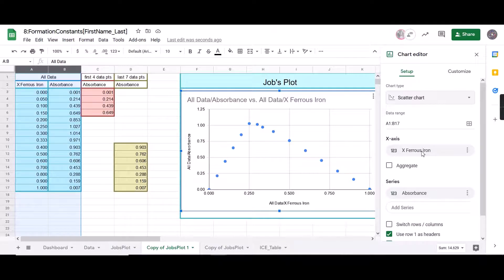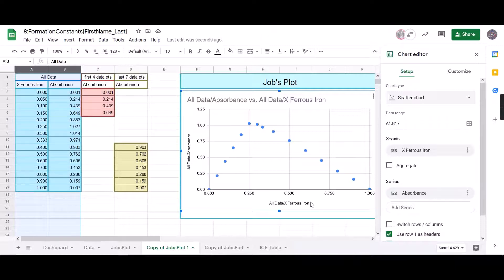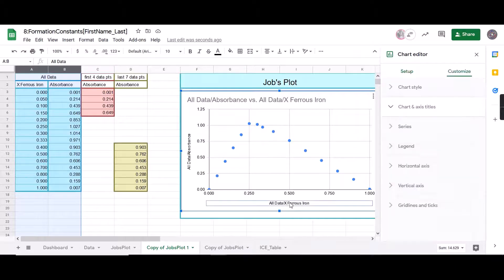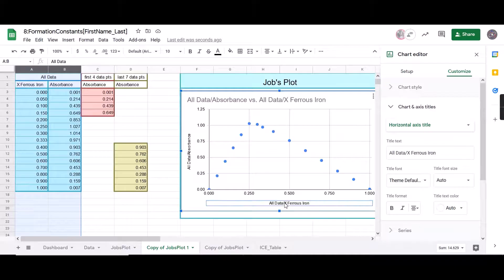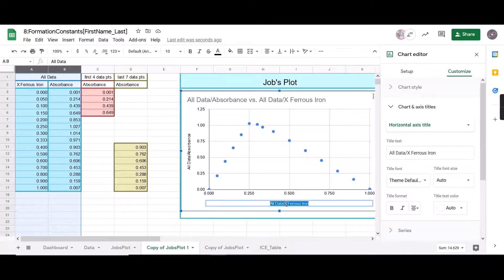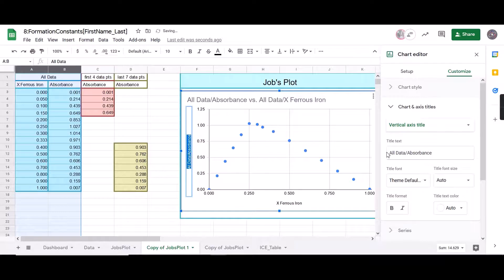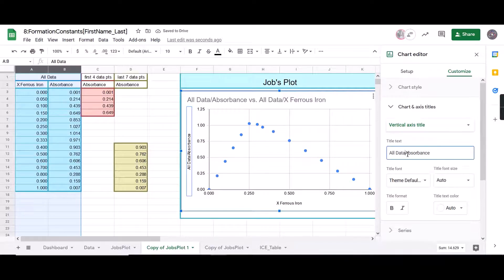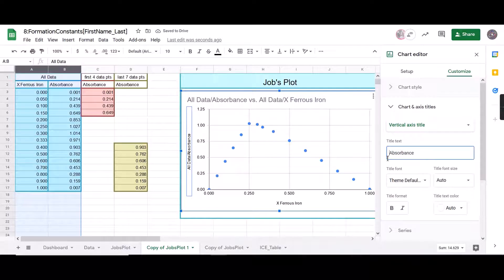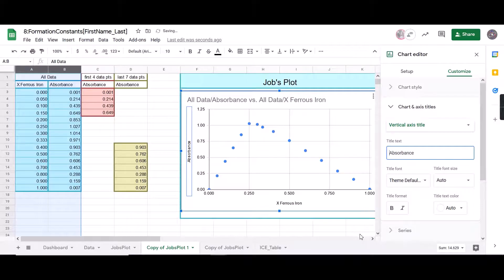You want to make sure that our x-axis is our ferrous iron and our series, which is our y-axis, is our absorbance. And we're going to double check that the labels for these are correct. You can either type over there or you can type over here when you double click on that.